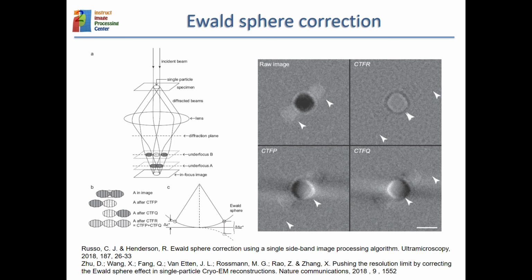And then when I put them back, I don't have to put them back into the plane, but I have to put them back into the sphere. And this is this Ewald sphere correction.